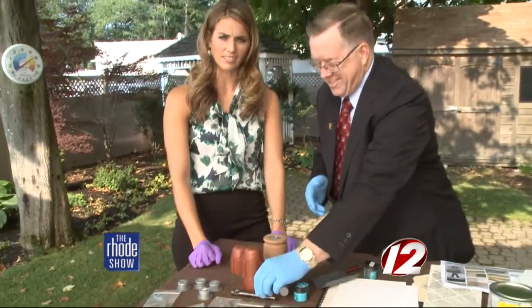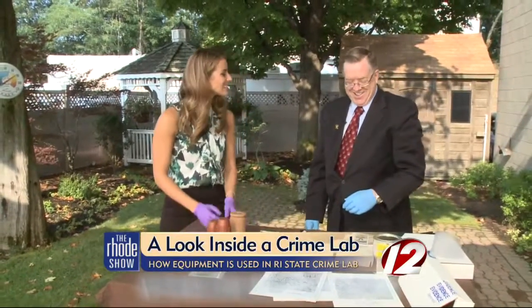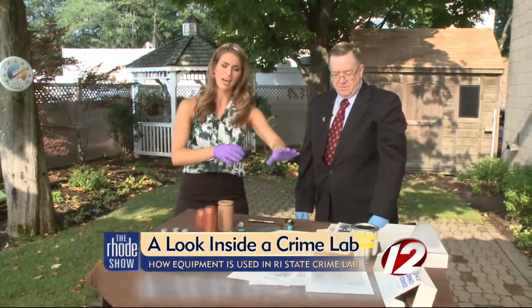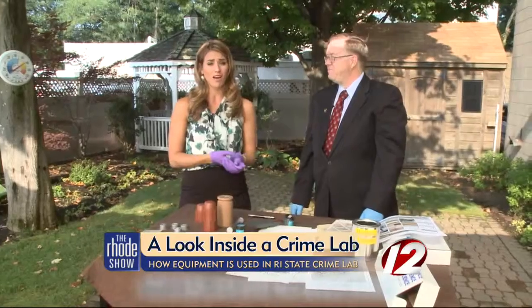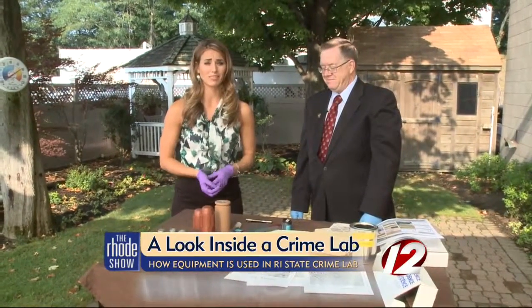So you have... I feel like we just solved the case. Apparently my fingerprints are all over it. Dennis, thank you so much for coming in and sharing. I feel like I know a little bit more — now I know how to package the knives, develop the fingerprints, and match the bullets. And if you'd like to read even more about the Rhode Island State Crime Lab, you can pick up this month's issue of Rhode Island Monthly. It's available now.